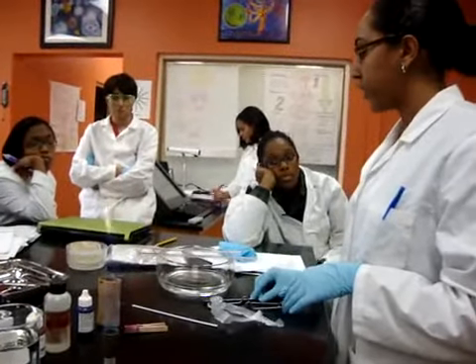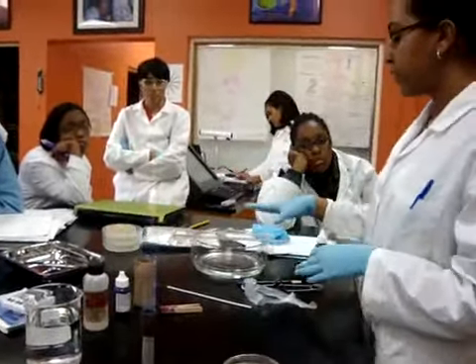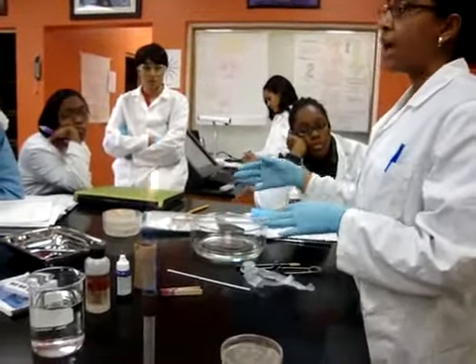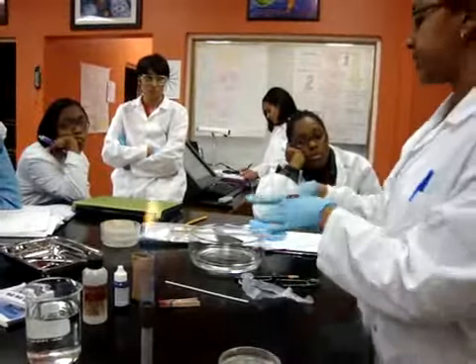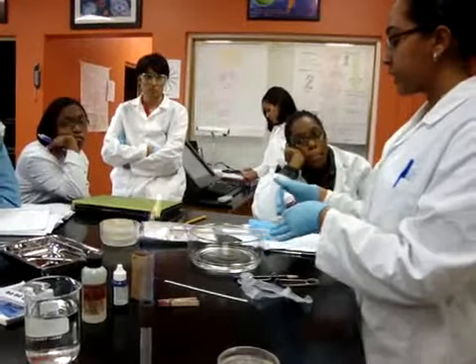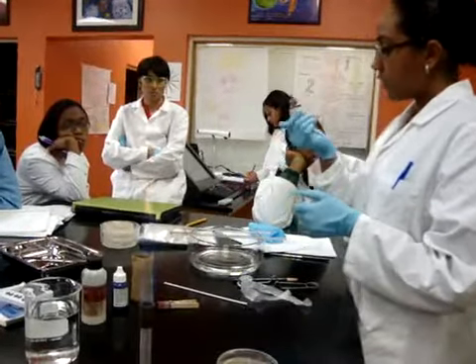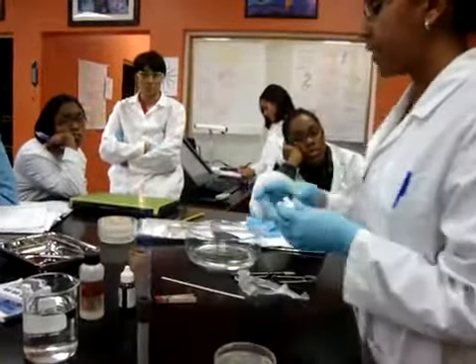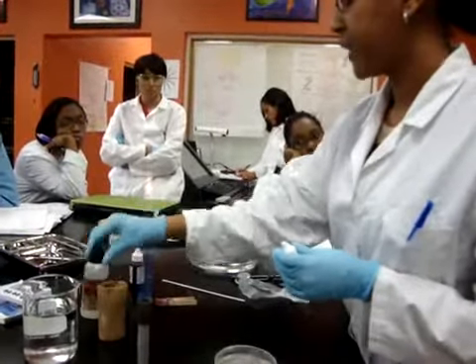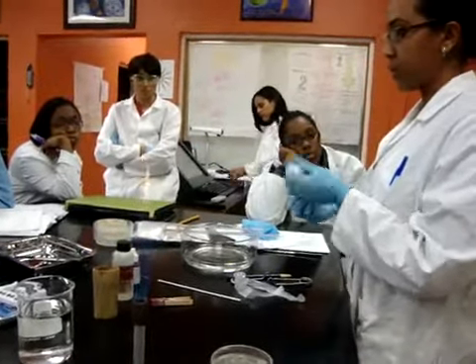And then you go into the Gram stain. The instructions are also in the kit. Basically, you just keep your slide over your dish, and you can do all three at once. I made that smear, I could go right back and make my other smear, leave that one drying, and have all three smears lined up, and then just go. It's crystal violet, then iodine, then alcohol, then safranin, but these instructions are also in the kit, which tell you step by step which one is which.